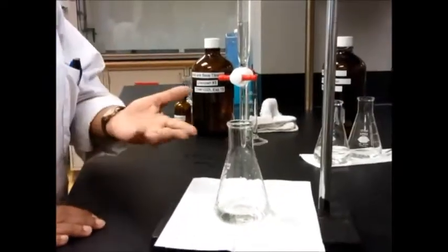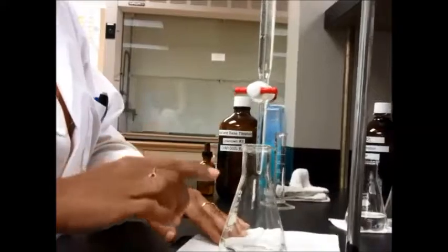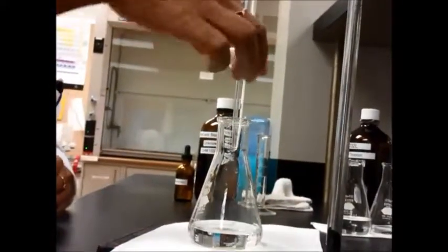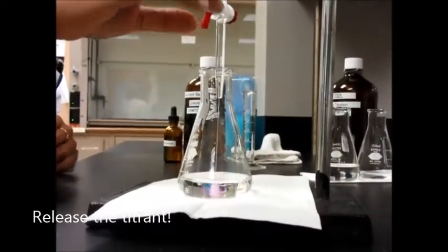When you're ready to do your titration, go ahead and place the Erlenmeyer flask underneath the burette tip. Make sure the burette tip is going inside the flask, then release the liquid — add the solution.